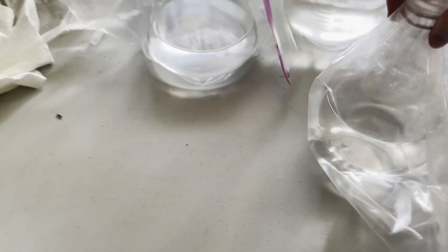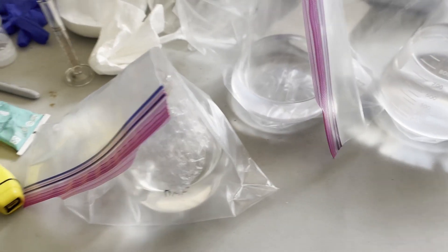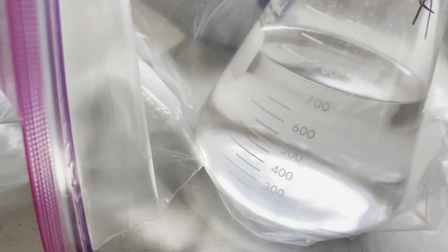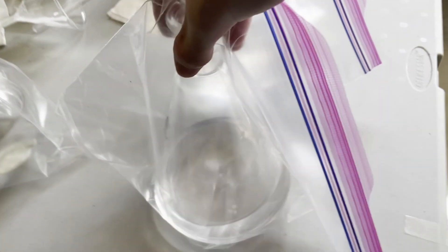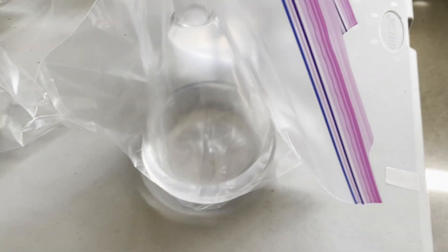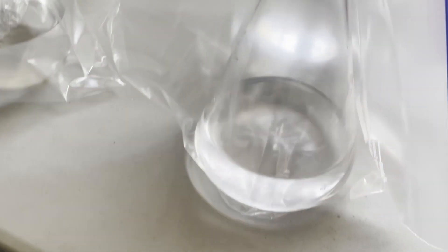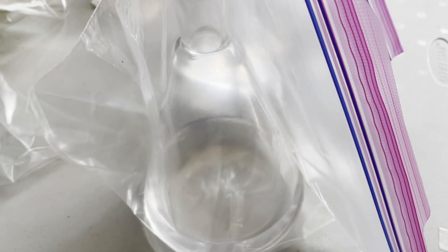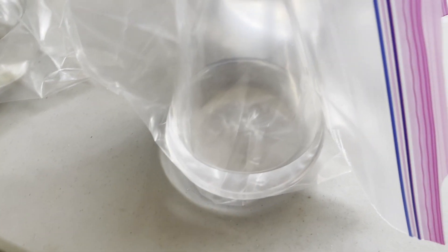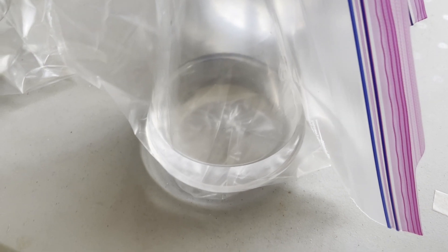Remember when I said that the ethanol was being really annoying? Well, this was the point that it occurred. No matter how many times I distilled the ethanol, insoluble particulate kept coming over, which was the calcium oxide and hydroxides from the original drying steps. I didn't want to filter the ethanol because that would expose it to air, making it wet again, which would just defeat the purpose. So I tried a fractional distillation, then another fractional distillation, and it still didn't want to get rid of the insoluble particulate.